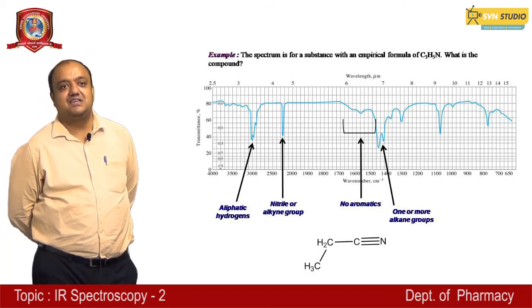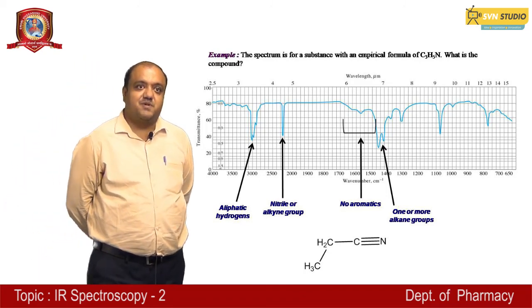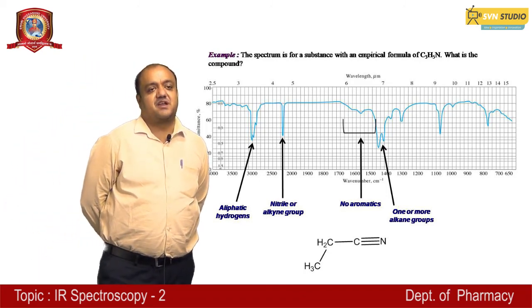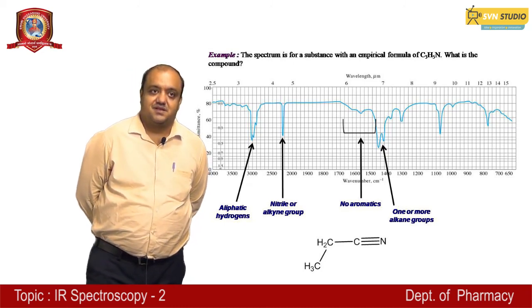And this is an example of some spectra which is determined by IR. And thank you.